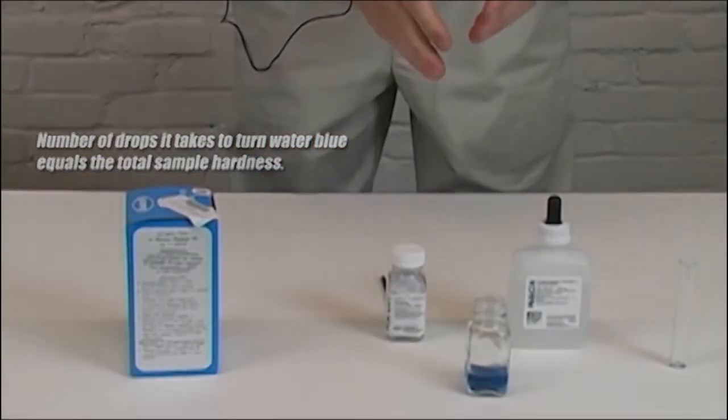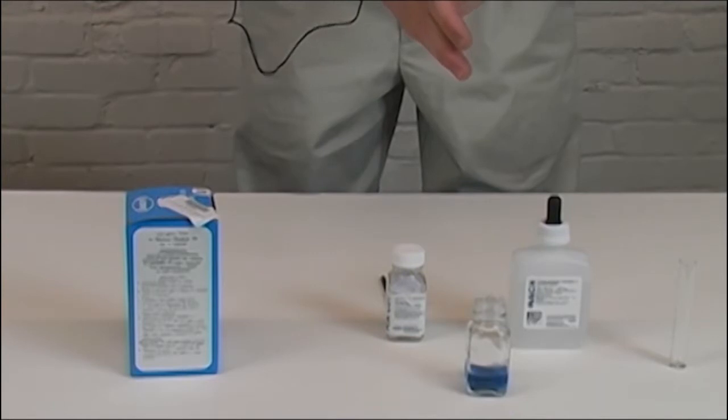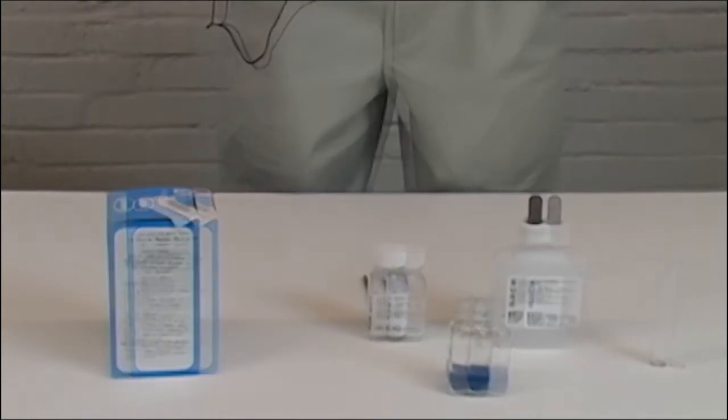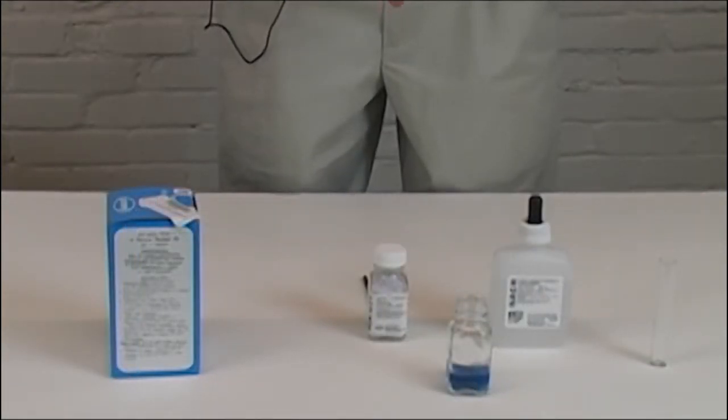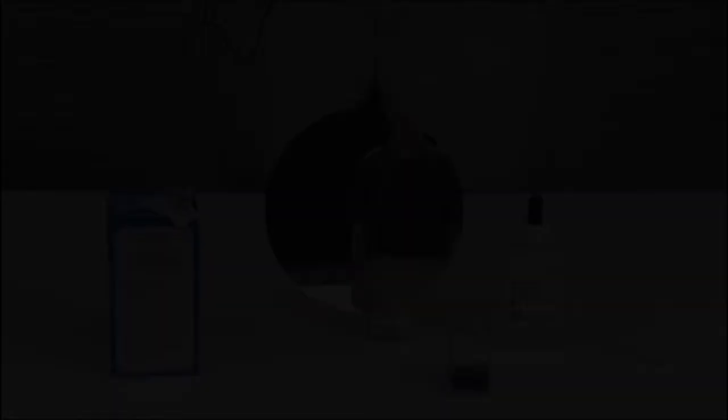So it took us seven drops for this to turn to the blue color and basically seven drops means seven grains of hardness. Every drop counts as one grain of hardness. Again, another good reason to do this test. It gives you an idea of where you're at as far as your water quality and also how much you're wasting on your soaps to try to get it to the level of foam and cleaning that you're looking for.